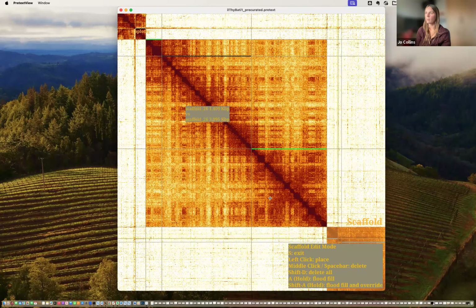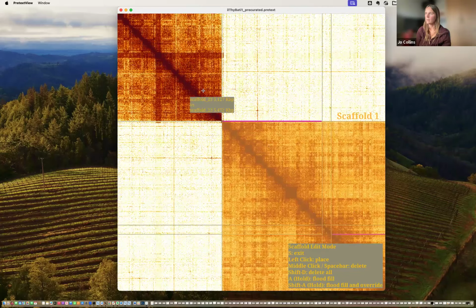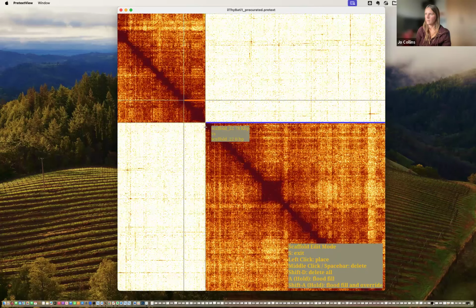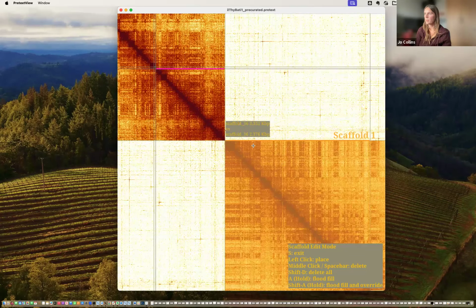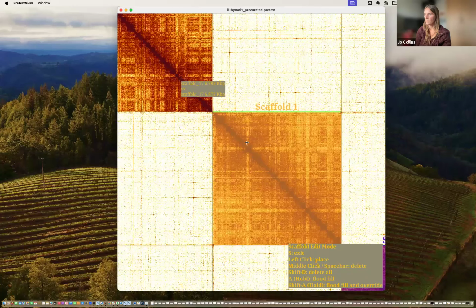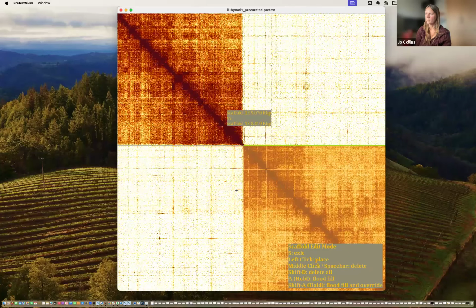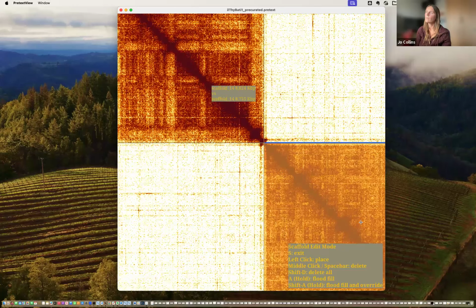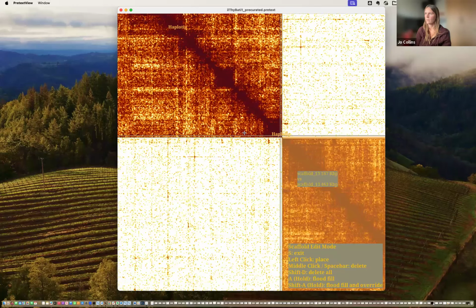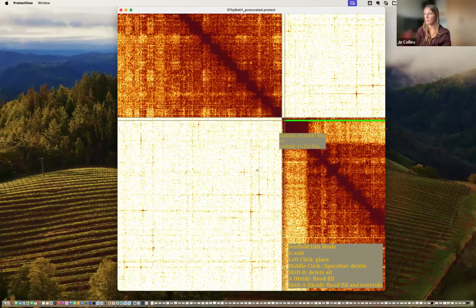Right, so I'm going to carry on going through using A, just zooming in. And zooming in. As I know, I put some small pieces on the ends of some of these. An example there.